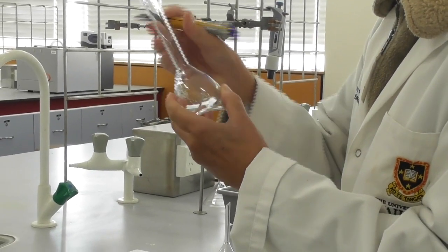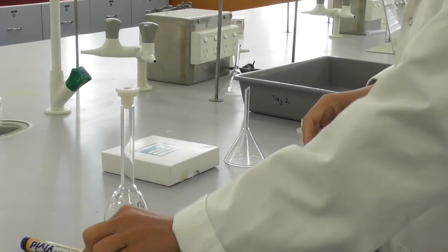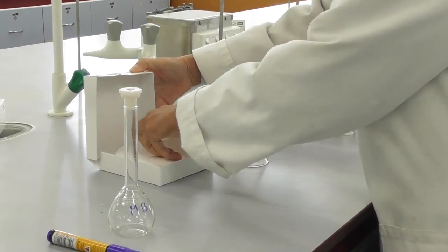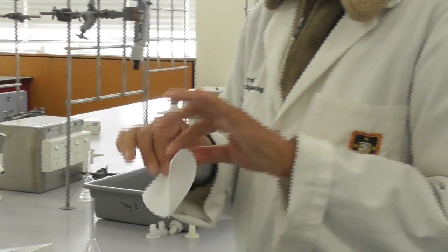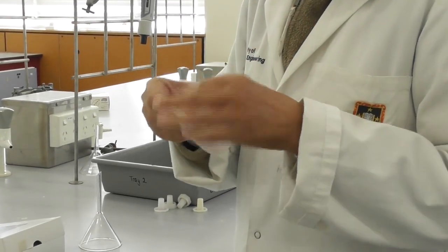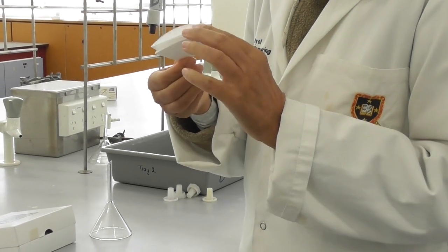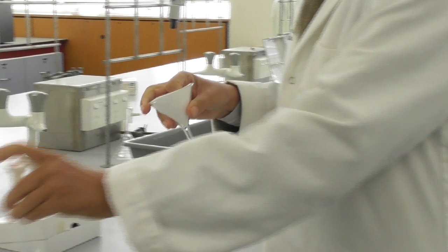At the bench I prepare a 100 milliliter volumetric flask and a filter setup. So I take a filter paper, fold it in half and fold it in half again to create a cone that I can put into my funnel.